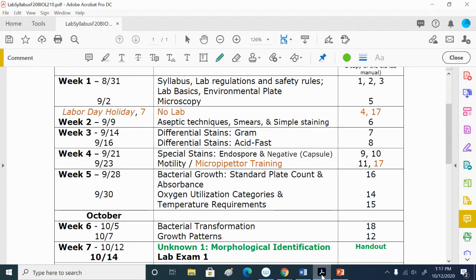And so you're not going to open a tube or a plate until you're ready to go in. So after you flame the loop, after it cools, then you can open your tube or plate to get your sample, right? But not before. And then always flame your loop when you're finished with everything, right? To make sure you kill whatever might still be on it. So always flame the loop before you use it and flame it after you use it.